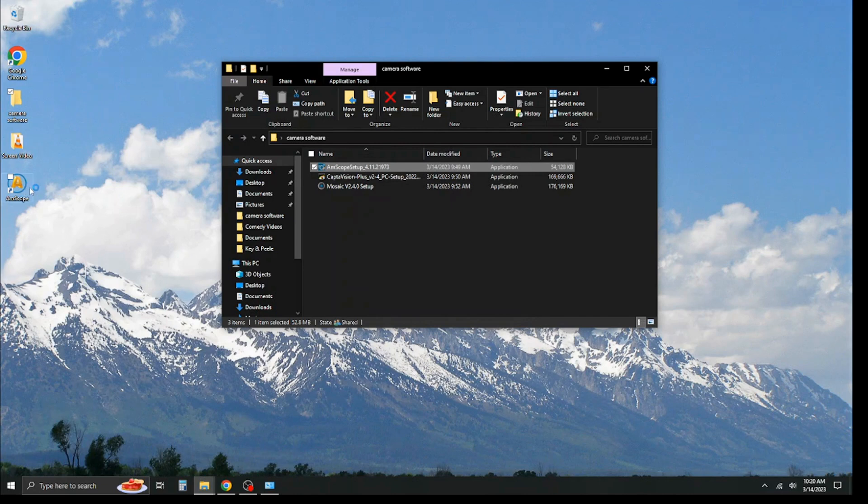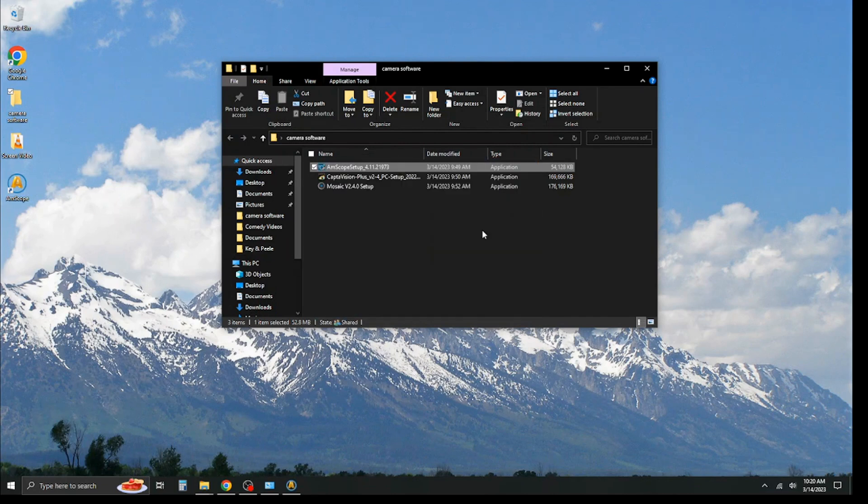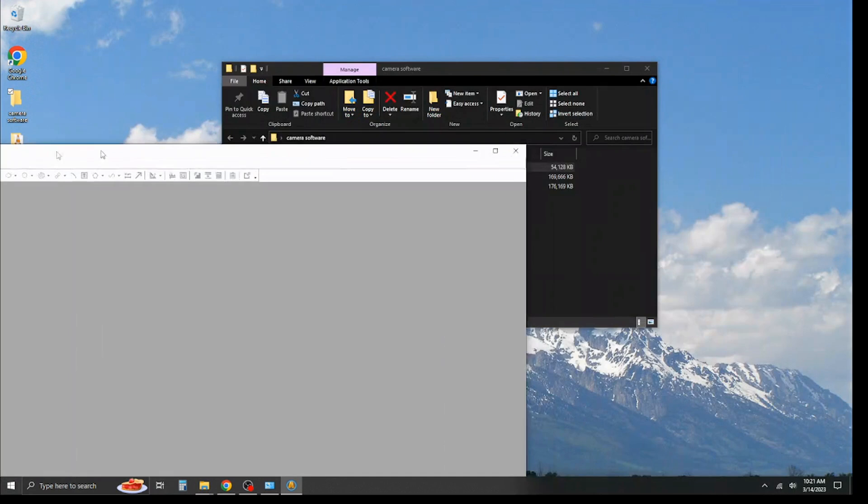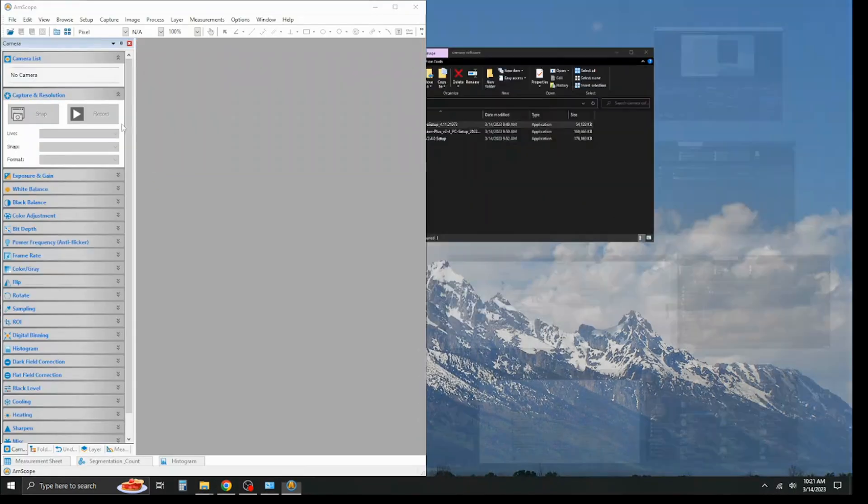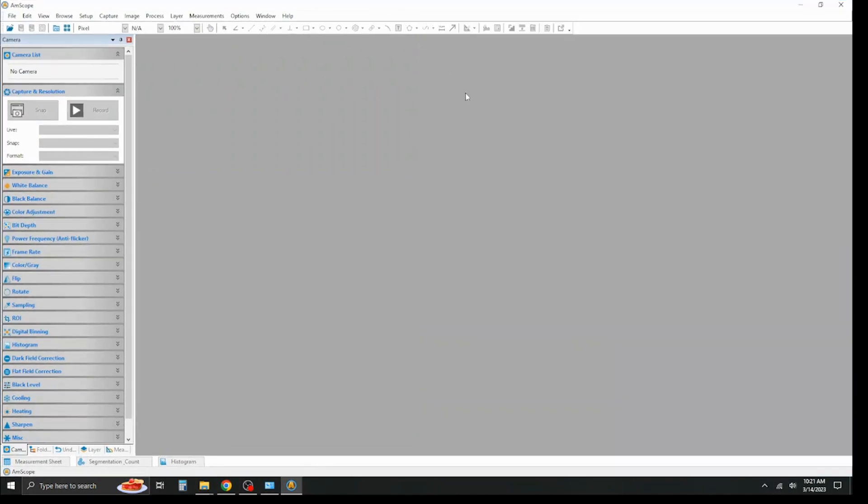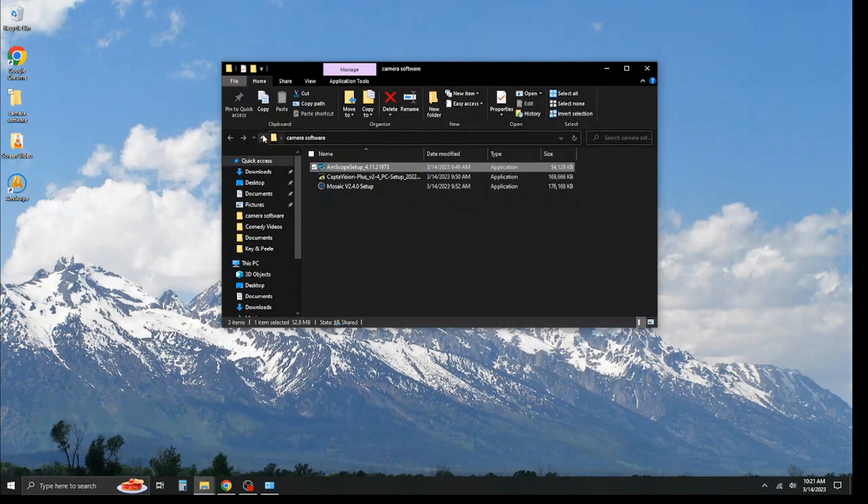And now you see your AMSCOPE software has been installed, and because we left that box checked, it's going ahead and launching. Now, it did open up on my top monitor, but I'll drag the software down so you can kind of get an idea of what you're looking at. This is just the basic software. You select your camera list, everything like that. I'll give you a tutorial on how to do that later on. This is just mostly covering how we install the software.